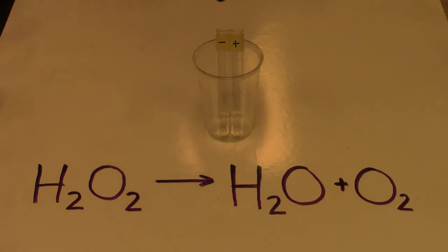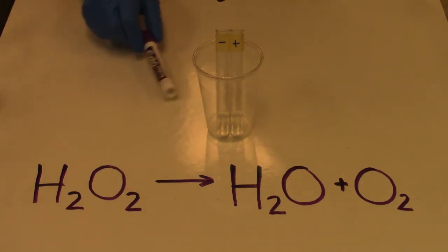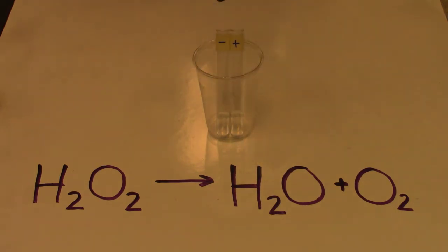In particular, we're going to look at this reaction. This is the breakdown of hydrogen peroxide into water and oxygen. And to do so, we're going to create a simple experiment to demonstrate this.